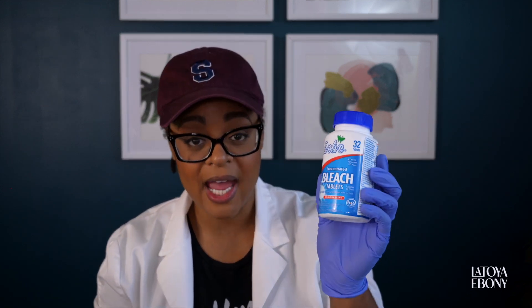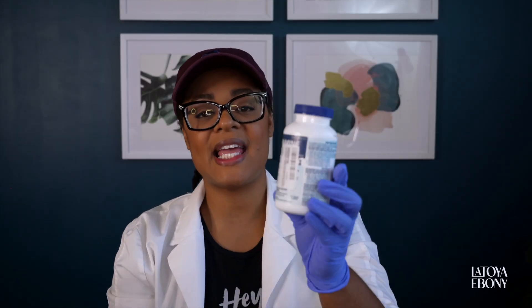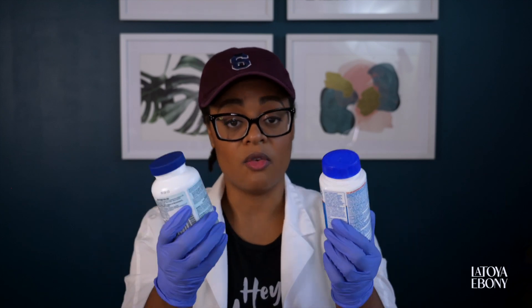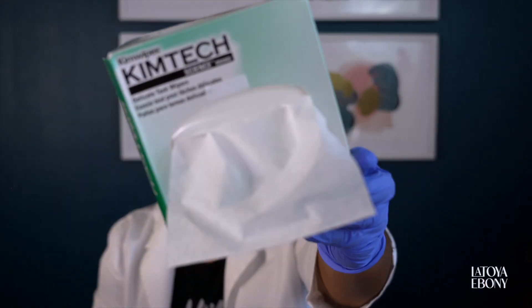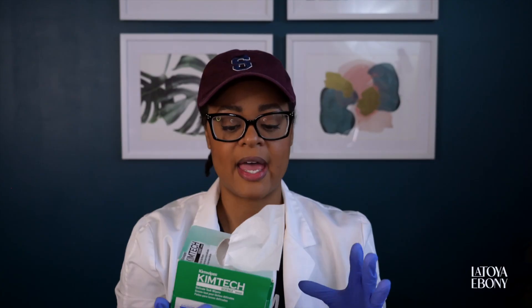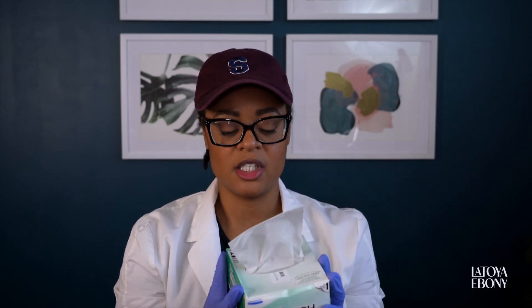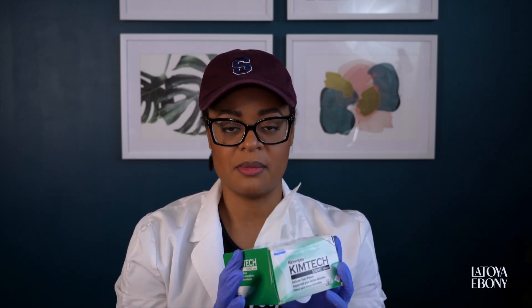Disinfecting, sanitizing, cleansing — all super important. I got some bleach tablets. I also got these Steremin tablets for sanitizing. For the bleach tablets, you dissolve them in water — I use 32 ounces of water in a spray bottle. For the Steremin, I do a gallon per tablet, then pour it into a 32 ounce spray bottle so I can easily work with it around my workspace. Kimtech wipes are wipes you use to wipe off your beakers and glassware without leaving any streaks or water stains — so lightweight, so great to use.